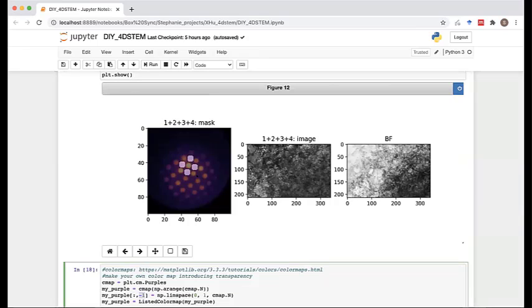And there was a comment I mentioned earlier about other packages, right? For example HyperSpy or py4DSTEM. They do have functions built in. And the idea here, and what Stephanie is demonstrating, is that you can do it yourself. You can just go in and modify those functions to answer the questions of your sample.